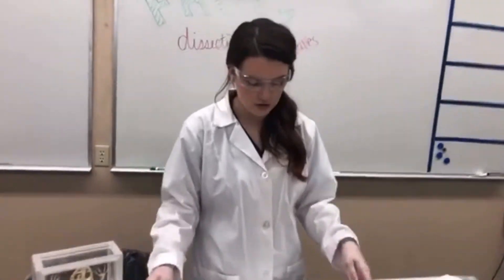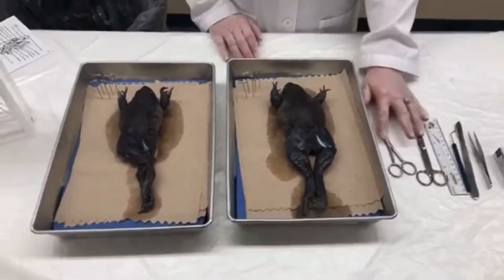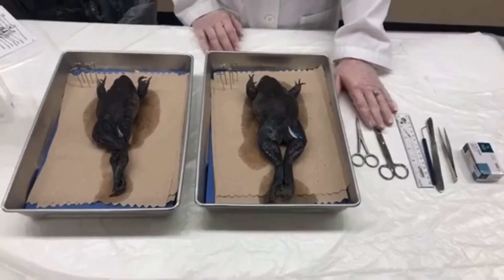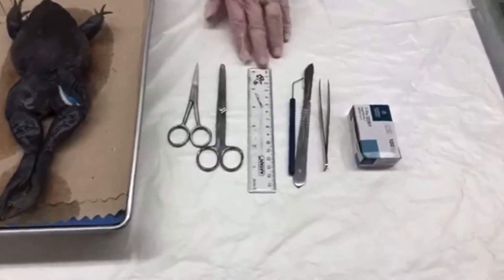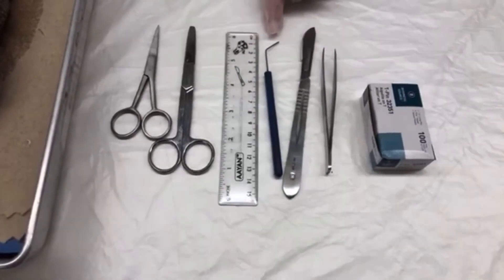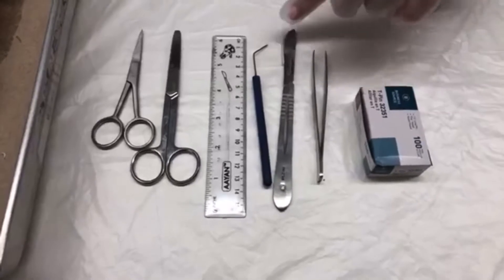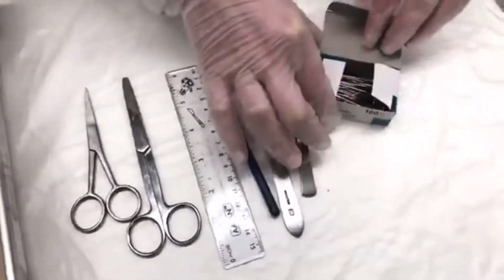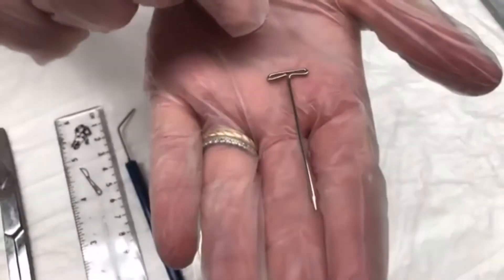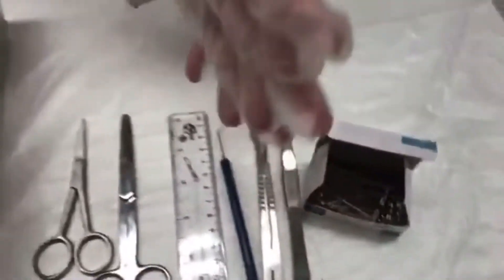I'm going to bring you guys a little bit closer so you can see the game plan here. We've got a couple different types of scissors to cut into our specimen, a ruler to help you understand the scale, a probe which is a little pokey tool to point to things or pick things up, a scalpel which is very sharp, tweezers, and T-pins that are essentially little pokey pins we can use to peel back specimens and hold them open. Of course, I have my gloves and eye protection.